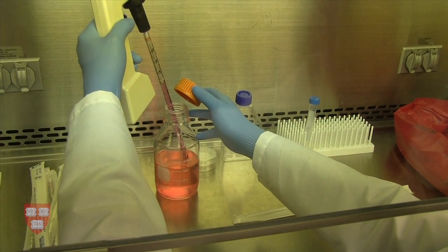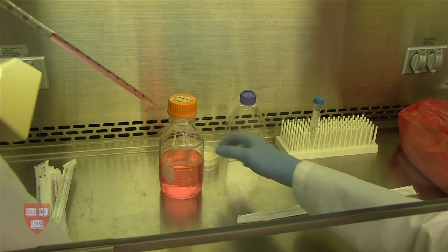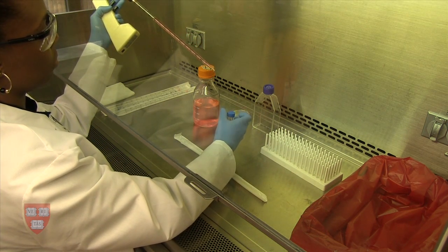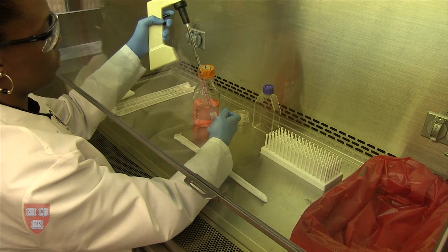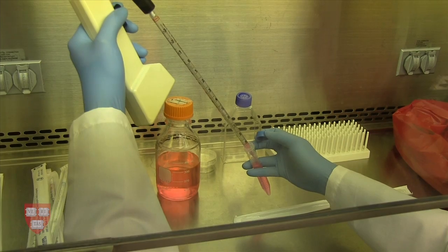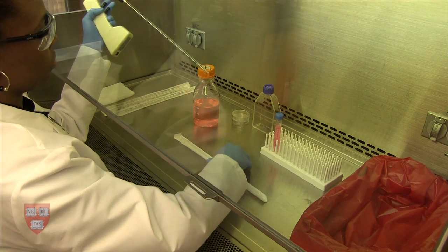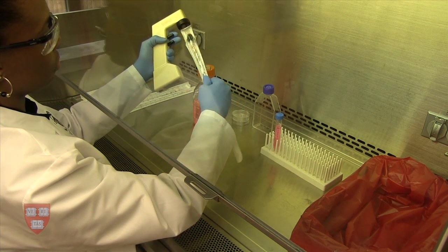To maintain sterility, remove liquid from containers at an angle. Keep bottles, flasks, and tubes covered as consistently as possible. Contamination from the hands can blow into the containers. Remember that it is the inside of the containers that is sterile. Treat the outside as dirty and clean with an appropriate disinfectant. Each pipette should be used once and then either discarded or disinfected if it is a glass pipette.